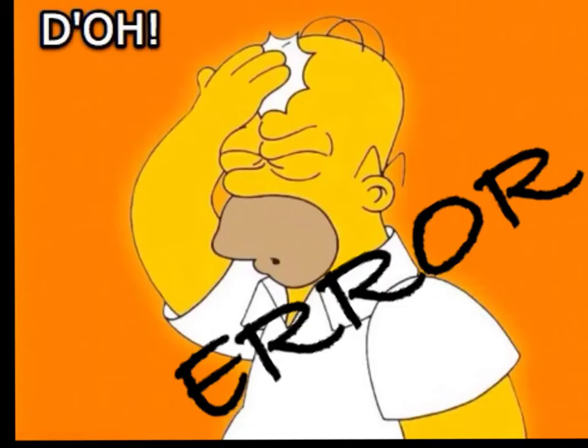A possible reason why we did not achieve cell growth for plates 3 and 4 could have been because the group may have plated the cells on the wrong side of the agar plate, or perhaps a more likely cause may have been due to the transformation inefficiency of the bacteria cells. Because transformation of bacteria cells is very inefficient, we could have needed thousands of cells on one agar plate to even achieve a minute amount of transformation. So perhaps there were not enough cells that were plated on the agar plate to achieve transformation.